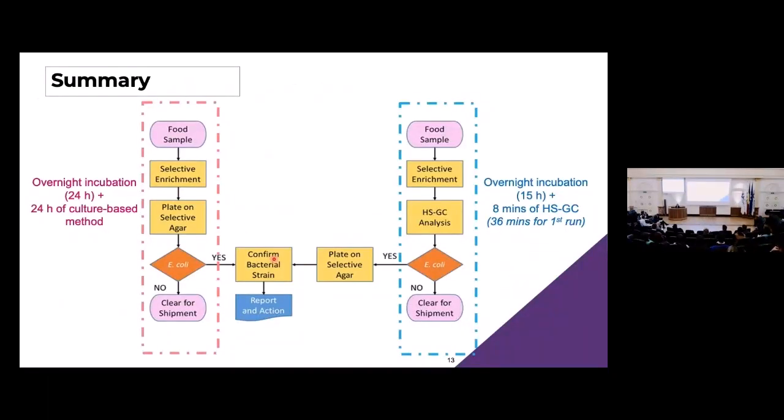I would just like to quickly summarize the technique that we're using over here. Compared with the conventional culture-based method, our proposed technique is able to successfully reduce the overall time to response by a day, which is a huge cut in terms of time.